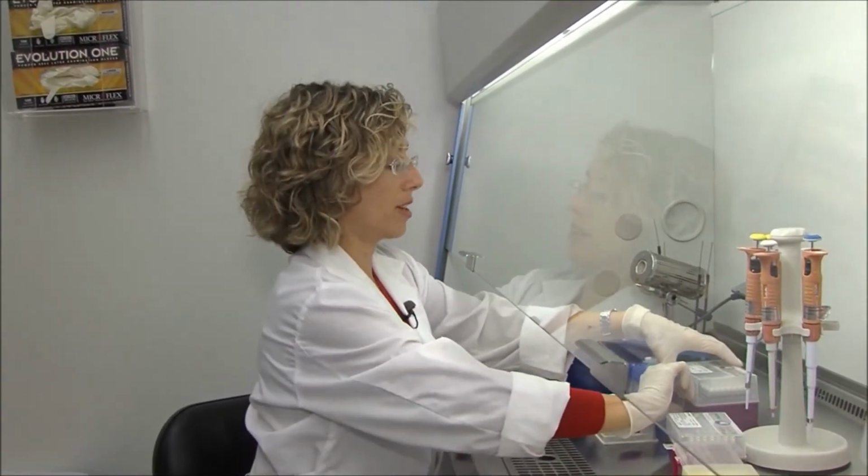The first reagent that we add to the master mix is water.